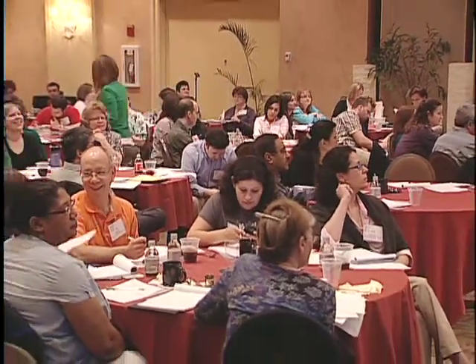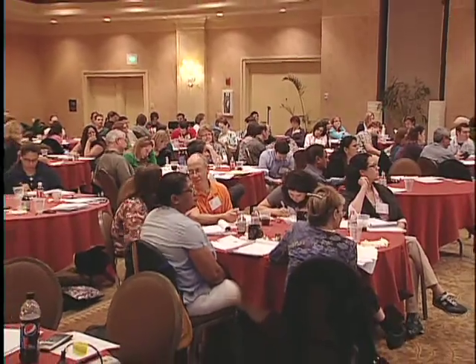So this kind of stems from some of the conversations we were having out in the hallway and during some presentations, but a lot of the validation studies we do and a lot of things we look at are pristine. We're all told to do mixture studies. So we all do the 1 to 1, 1 to 2, 1 to 5, 1 to 10, 1 to 20, and 20 to 1, blah, blah, blah. But we usually do it with just pristine samples.